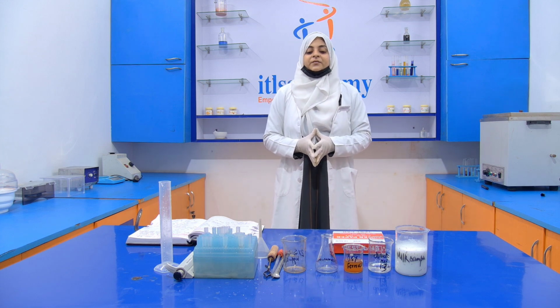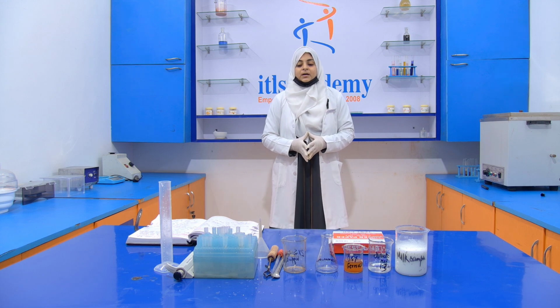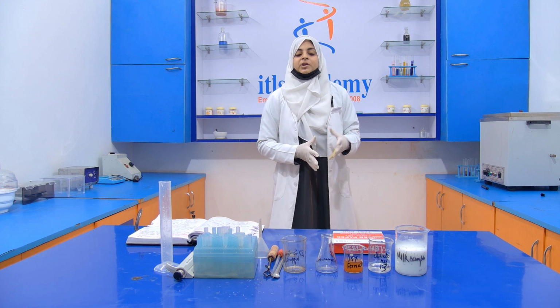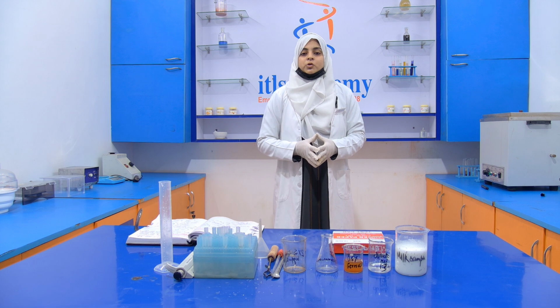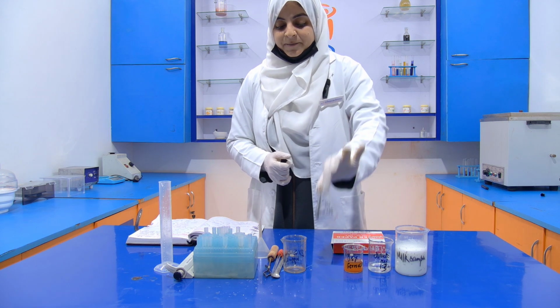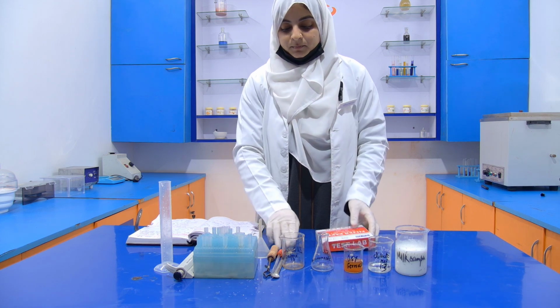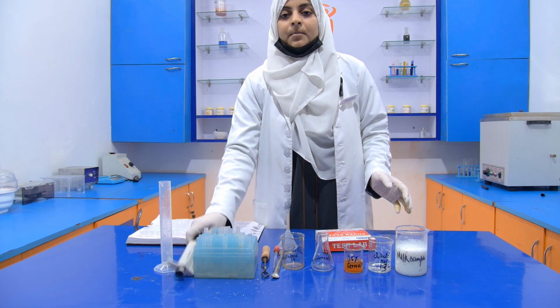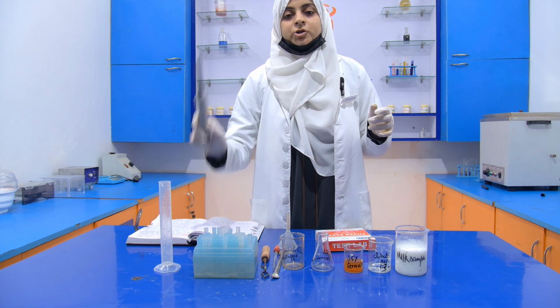The second reagent that we require is 0.5% ferric chloride. For the preparation of this, we dissolve 0.5% ferric chloride into 100 ml of distilled water. Then we require a conical flask, beaker, filter paper, dropper, funnel, micropipette of 1000 microliter or 1 ml, micropipette tip, and measuring cylinder.